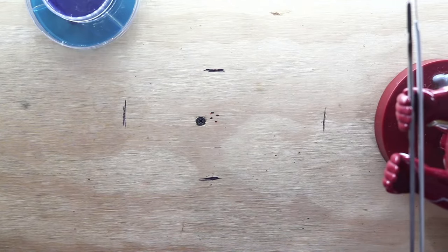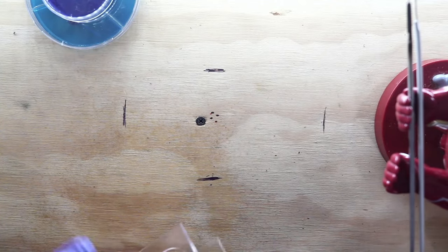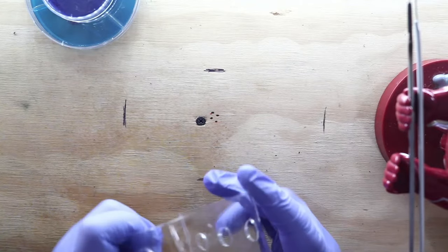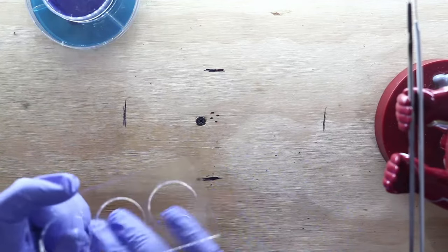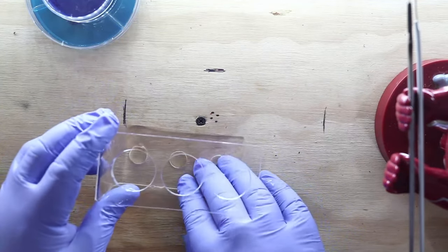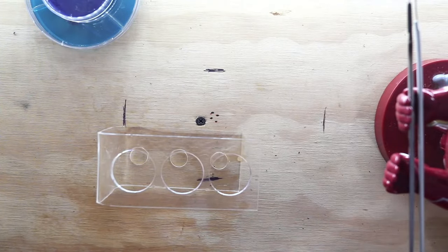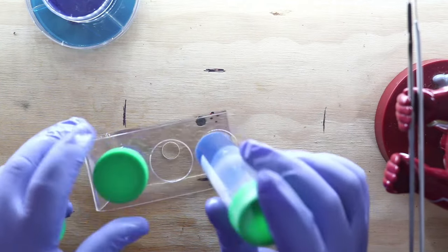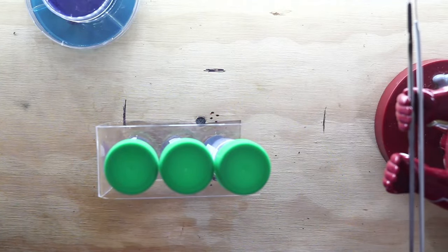Now, let's move on to, really quick, I'm going to just spritz off my little tool I've made here. This is my slant holder. And this would all be better on a wipeable stainless steel table, but we're just kind of popping it up in the podcast room on the wooden table. Well, it was easier to set up in the studio than it was to set up in the lab, so.